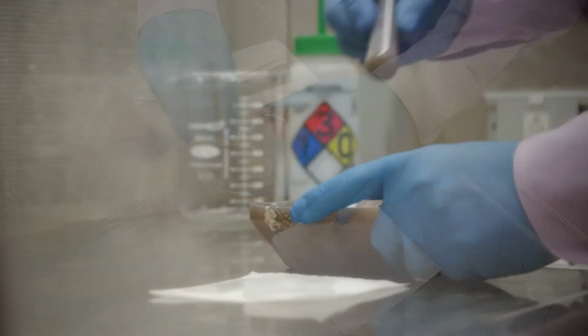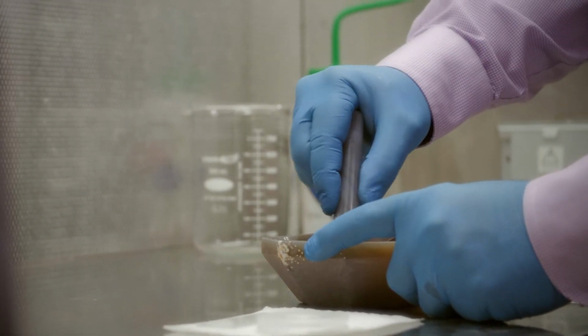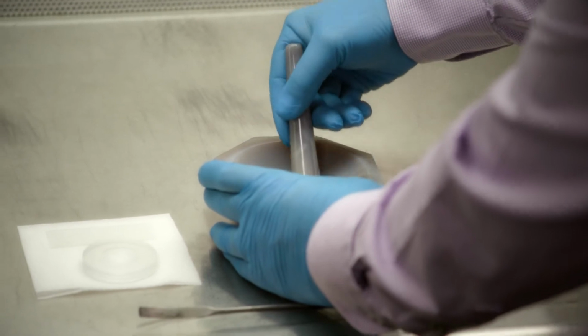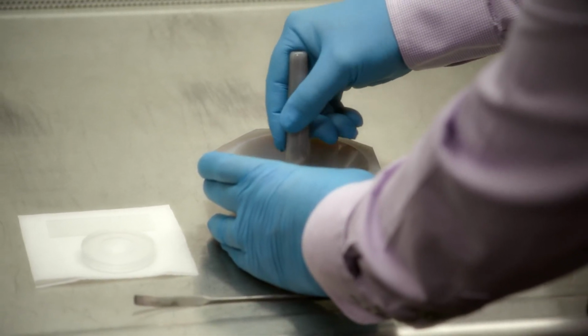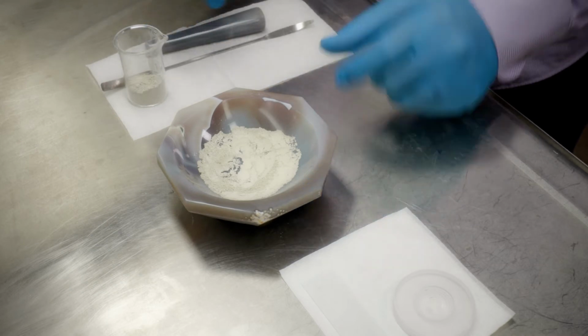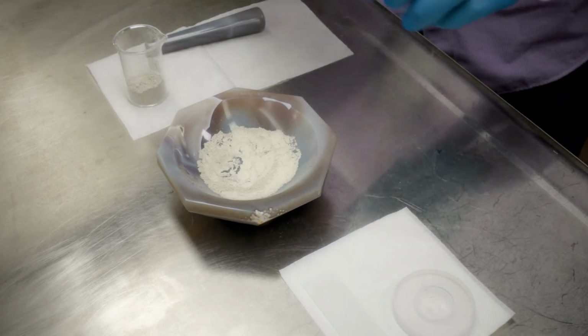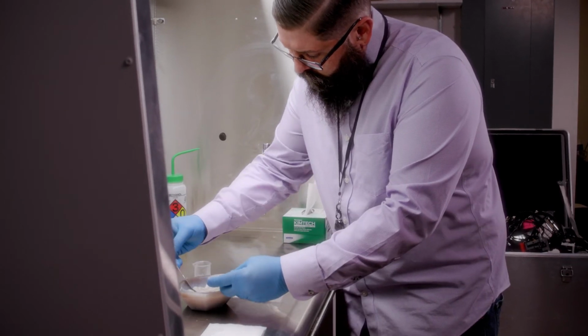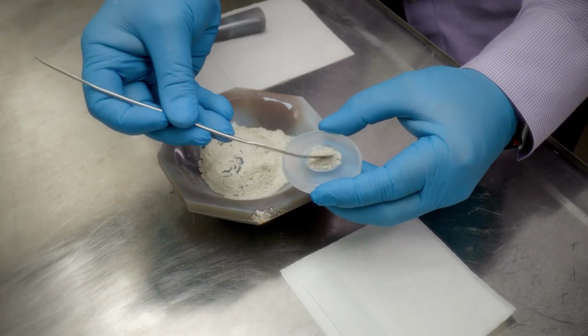Ideally, samples should be homogenized and finely ground to a uniform particle size. This is not always achievable due to the nature of some research samples. Sample preparation should involve grinding in a mortar and pestle, or use of some other mechanism to homogenize the sample. Samples that need to be analyzed as is may be mounted in the deep well sample holder.